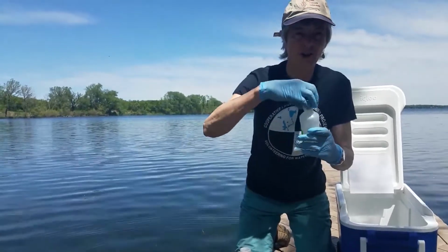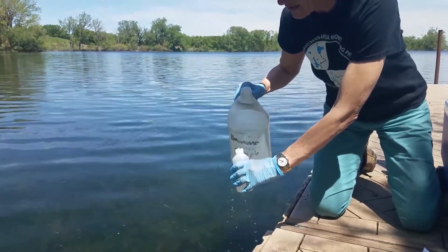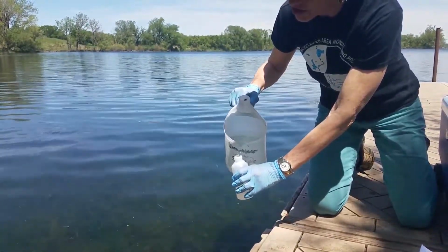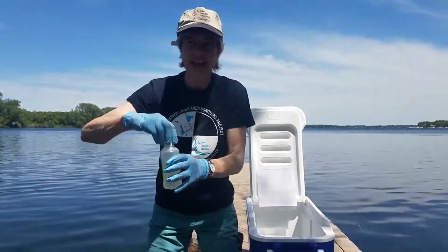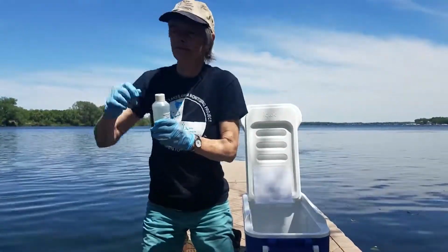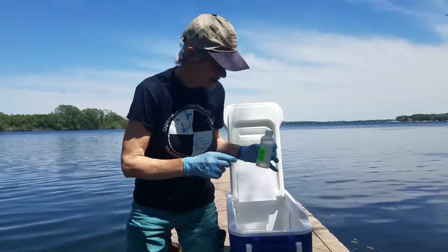This is going to be for our nutrients, for our phosphorus and nitrogen analysis. Once again, you want to be especially careful on this one that you only fill up to the shoulder because of the drop of sulfuric acid inside. And believe me, the sulfuric acid is hard to see. Don't take the cap off and go, where is it? It's just a little drop in there. It's kind of hard to see, but trust me, it's in there.